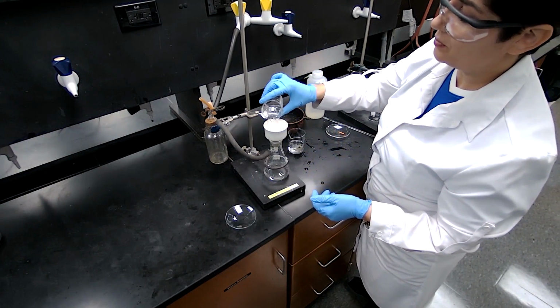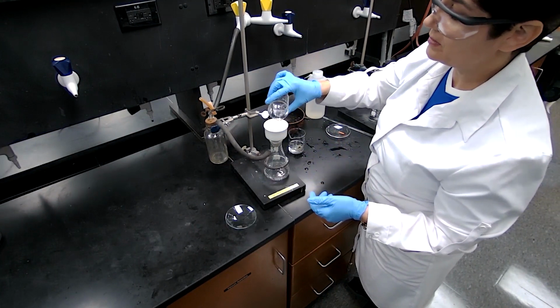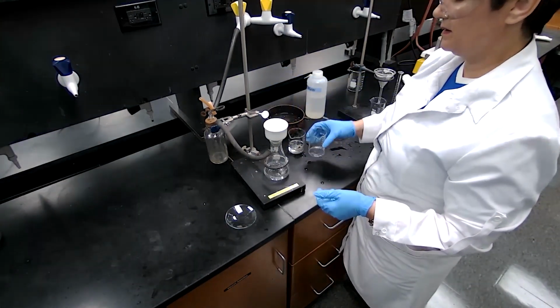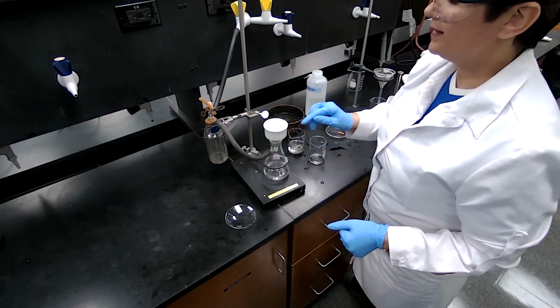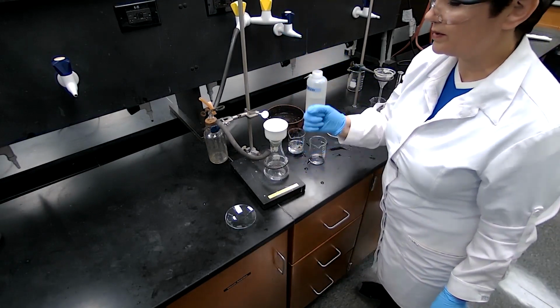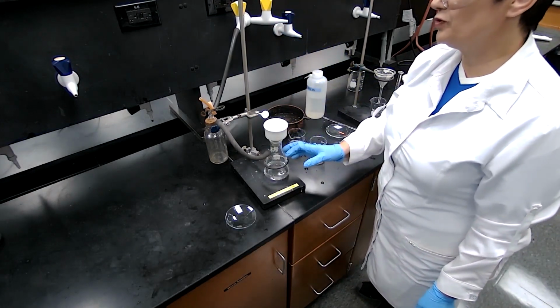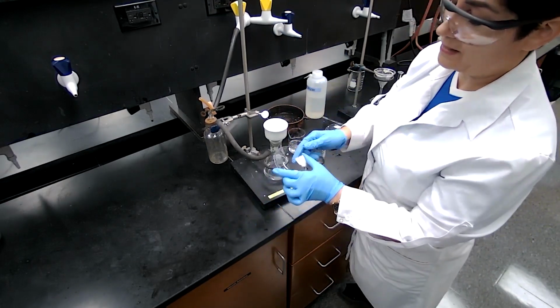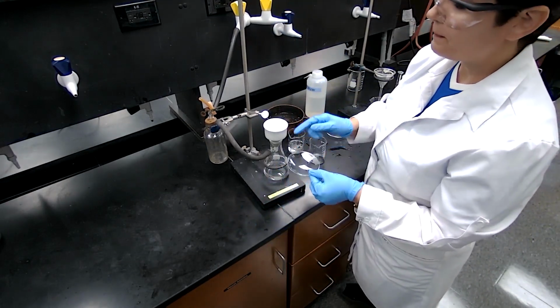By transferring over the crystals, we wash them with the cold water and run the vacuum for 5 minutes to make sure that all the solvent is removed and the crystals are almost dry before we put them in the oven.